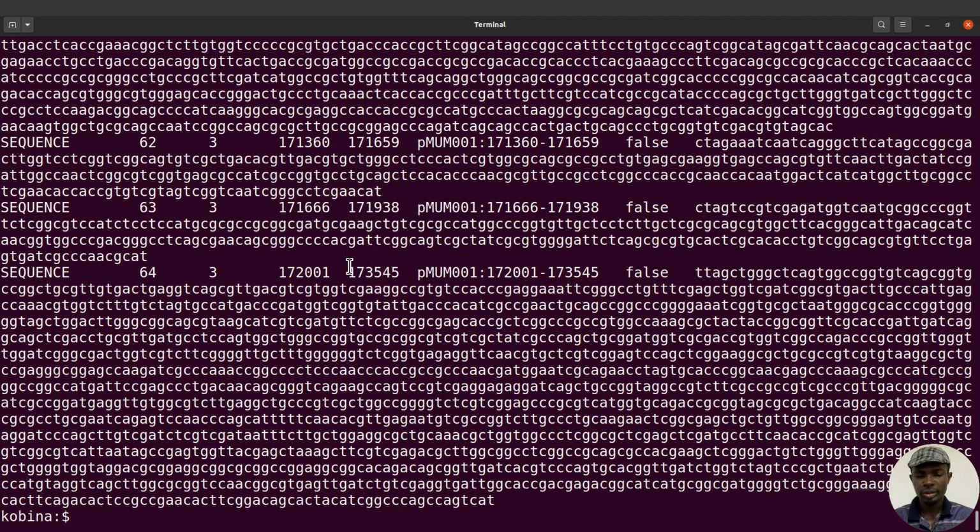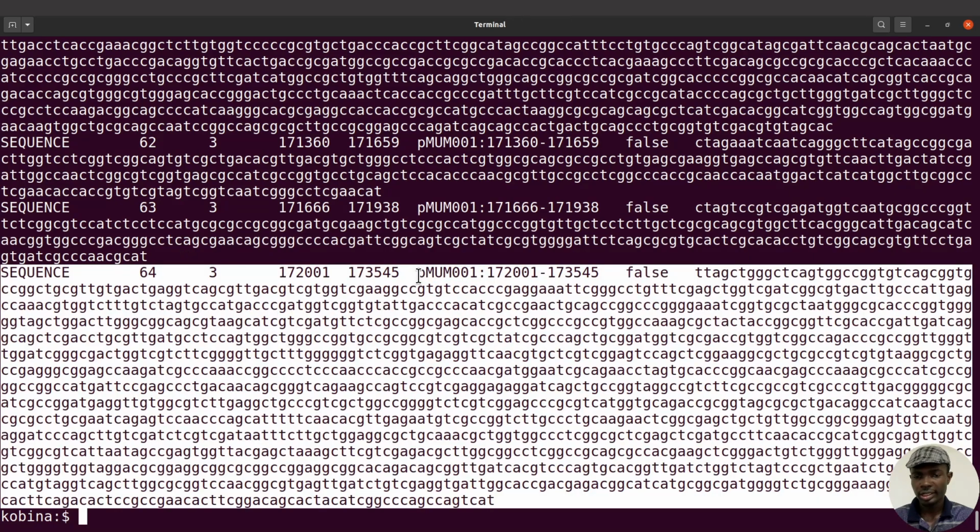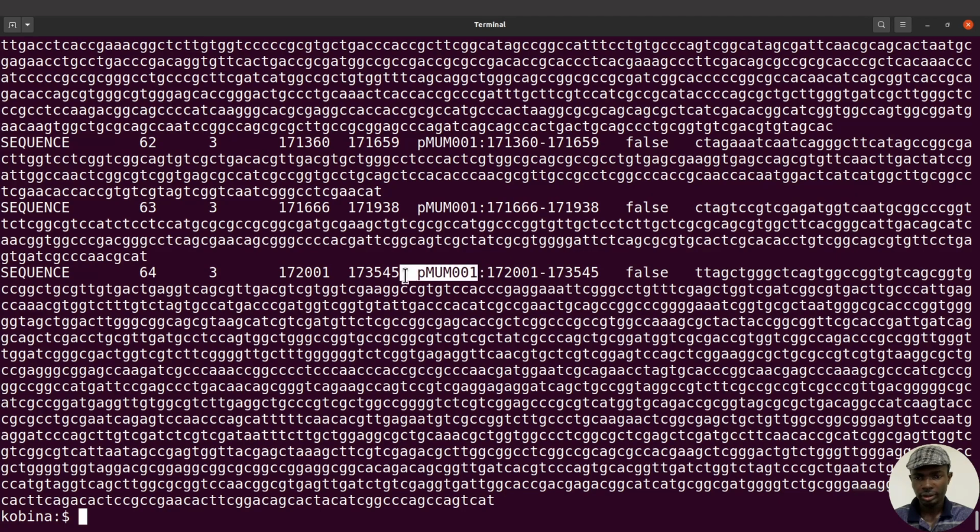All right. With the information, just look at the last few lines here, and then look at this one, for example. So we have the information here. We also have this accession ID, this one here, and we also have this. All right. And we have this and this. Now, this one is a plasmid for the AG199 strain. But with the data we have, it's for the chromosome. The variants were identified on the chromosome. So we need to also look at the name that was assigned to the chromosome, and then we can proceed with the issue.